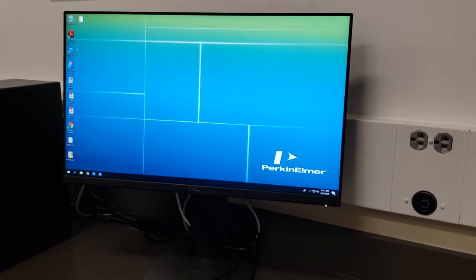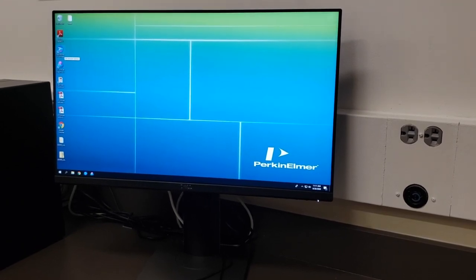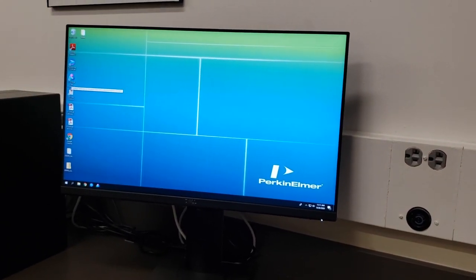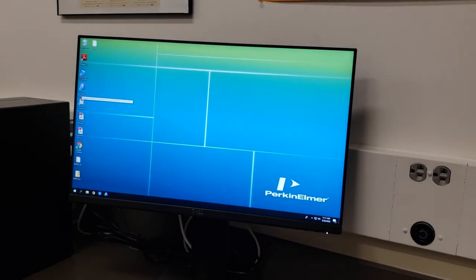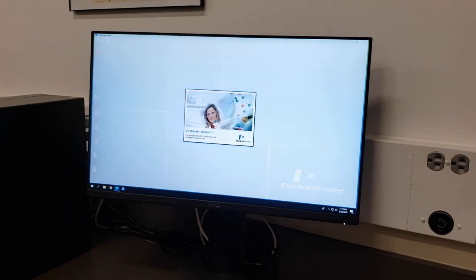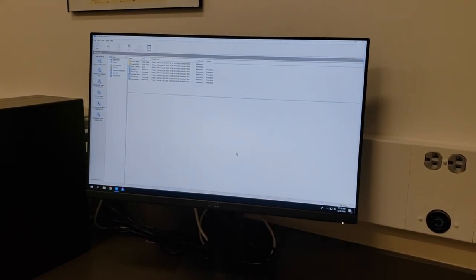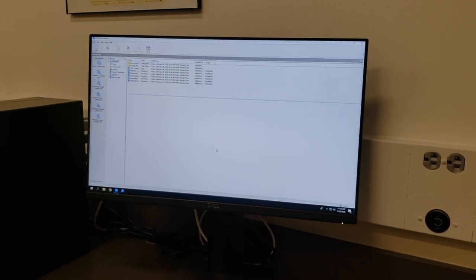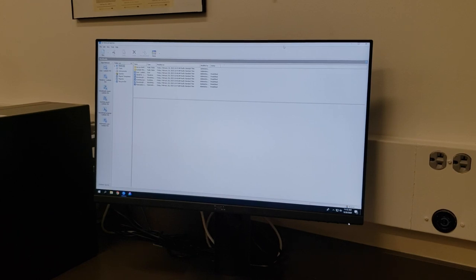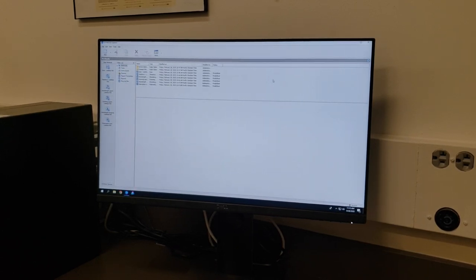At the computer there are two software programs. The first is Perkin Elmer UV WinLab, and the other is the UV WinLab Data Processor and Viewer, also called DPV. We're going to start with Perkin Elmer UV WinLab, log in as analyst, and it will bring you to the main page. It will automatically be connected to the instrument unless the instrument is turned off, in which case you'll get some errors. If the instrument is off, close the software completely, turn on the instrument, wait at least five minutes, and then reopen the software. The instrument and software work together very closely, so having the instrument off will cause issues.